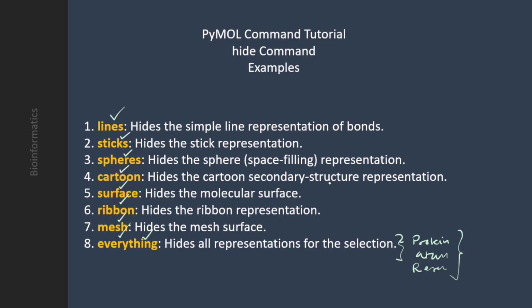All right, so with that note, I'll be showing you how we can use different commands and what outputs we will be getting. Let's move to the PyMOL interface.